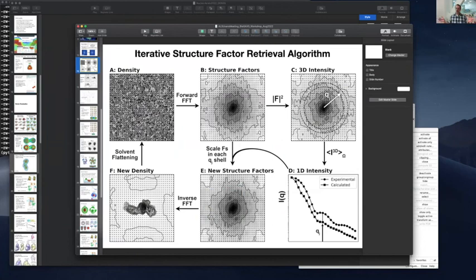If you go to a larger size, something like 5 times the size of the particle, then you'll have more shells and therefore you'll have more bins. It's the same maximum q value because the voxel size is still the same. But then you get more solvent that you're flattening, and so you get more bins. And so you can control it in that sense.